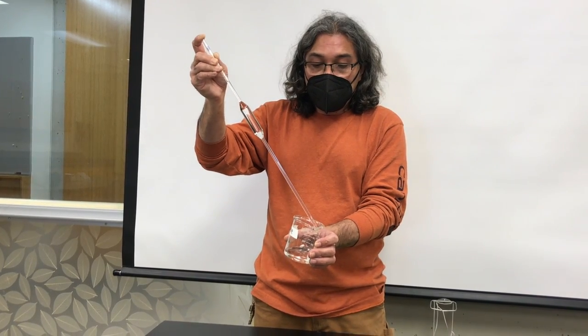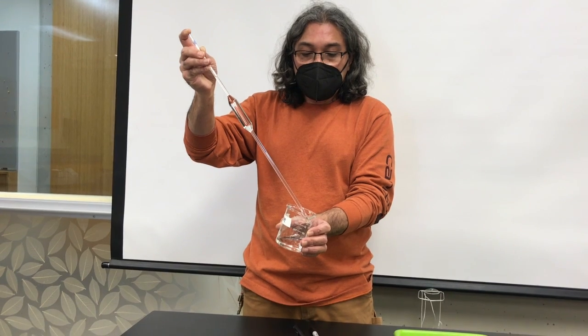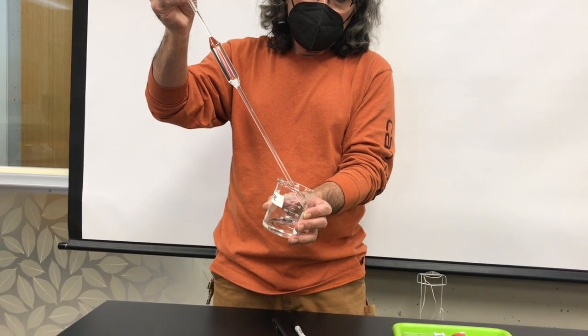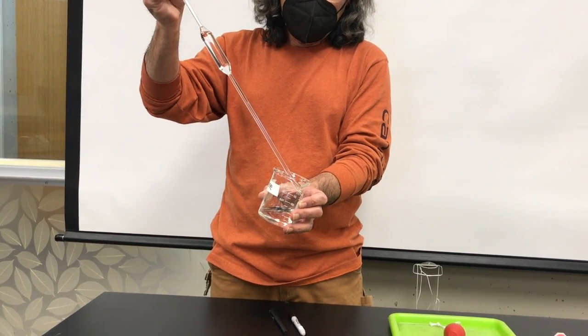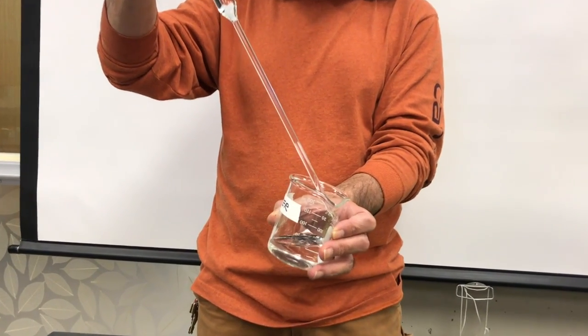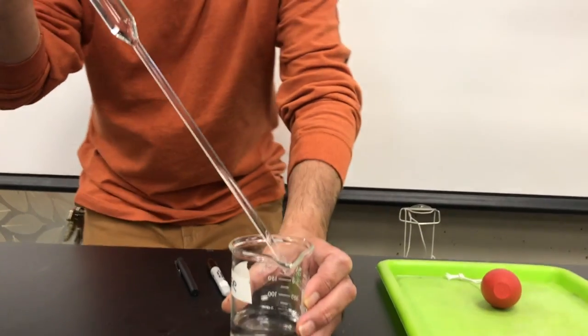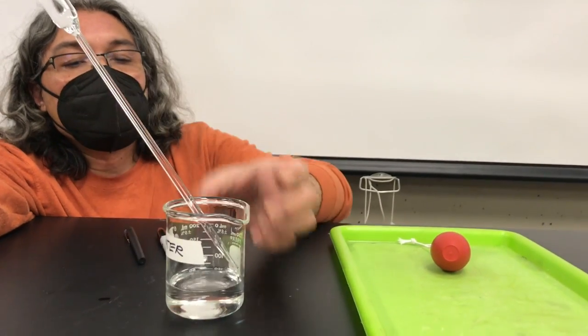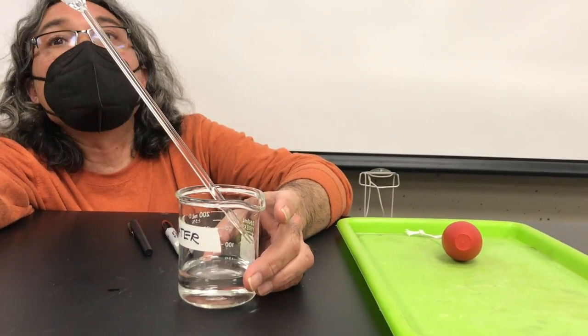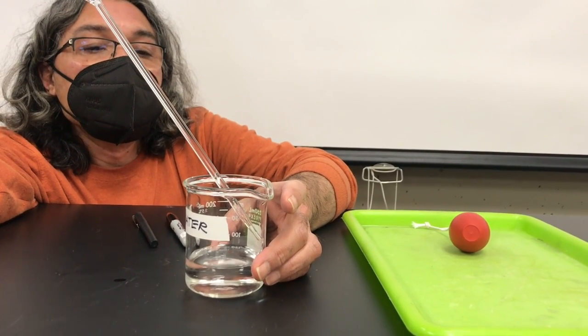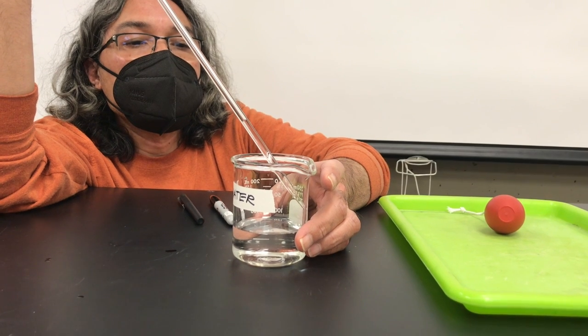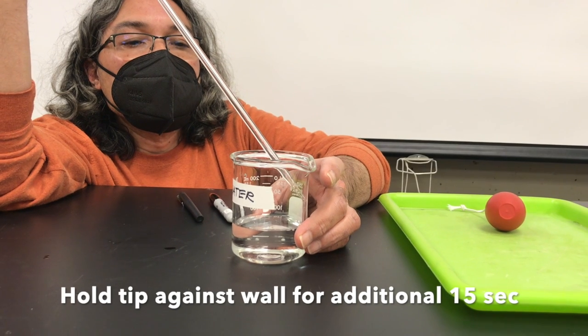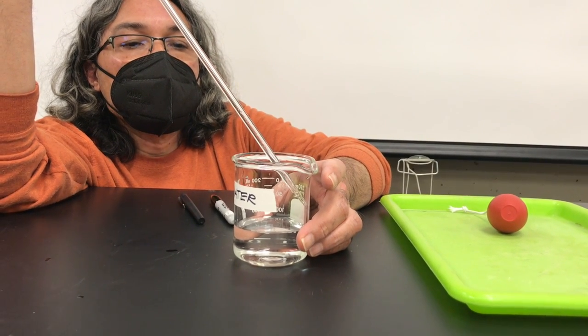You want the tip of the volumetric pipette to touch the inside wall of the beaker. This could also be another volumetric flask. And then you're just going to let the liquid flow out on its own. So I'm doing this while the tip is actually touching the inside wall of the container where I'm transferring the liquid.